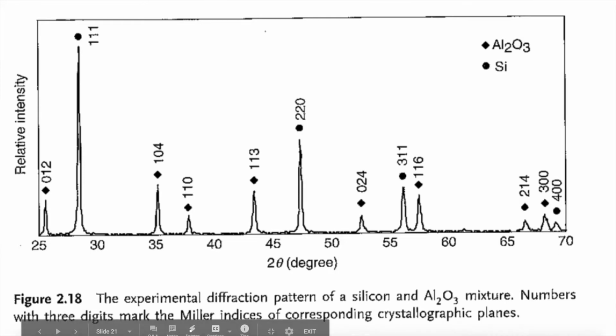Okay, so this is typical data that we will see in a diffraction experiment. So the peaks here refer to those cases where we have a lot of X-ray intensity, when the X-rays are in phase and therefore constructively interfere, and that happens at those specific Bragg conditions.